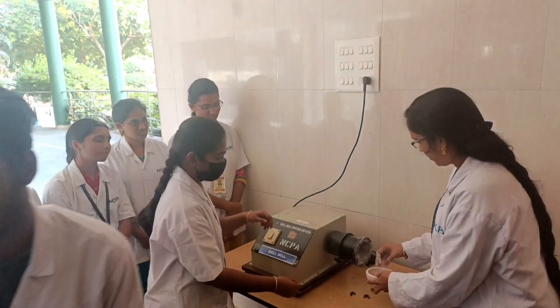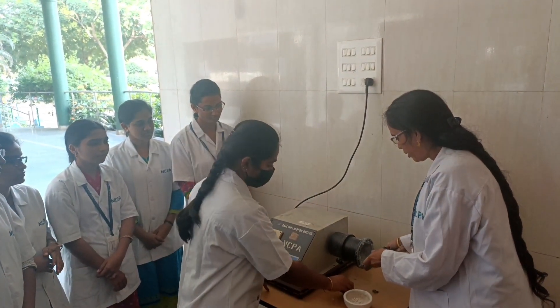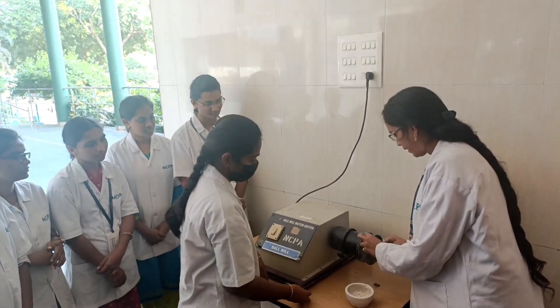You have to fix it. You have to fix it, okay? Let it be fixed.